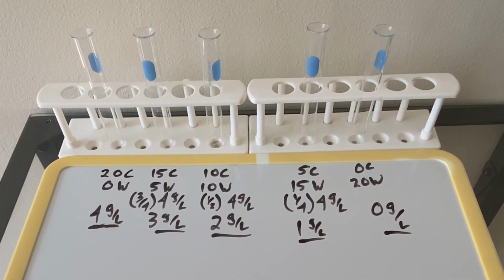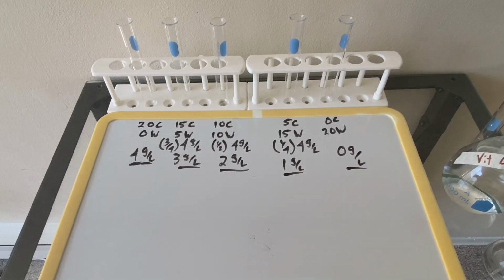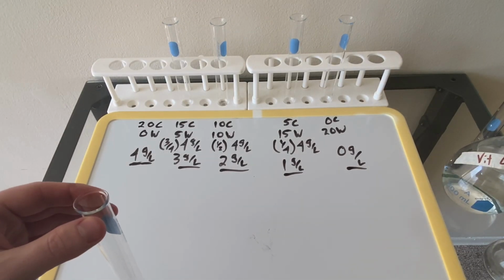So at this point, what I'm going to do is make those solutions, first adding drops of vitamin C, and then adding drops of water.